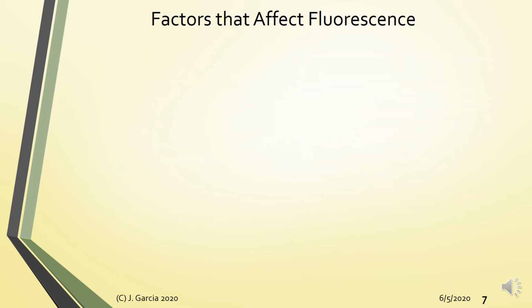Amongst the spectroscopic methods, not counting mass spectrometry, fluorescence spectroscopy is the most sensitive technique. And why is that? It's simply because it's the analyte itself that gives you the analytical signal.